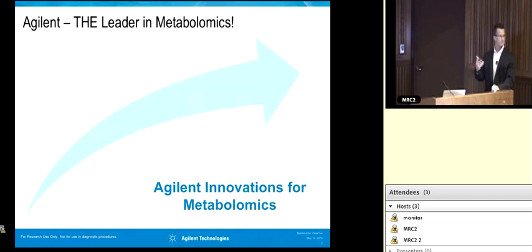Flux can be thought of as kind of like a CAT scan. There are a lot of times where an X-ray will answer the question or address the problem, find out what the problem is that you have. As a step 2 to that, in many cases, if that doesn't give you enough information, you're going to go to something like a CAT scan that will actually dig deeper.